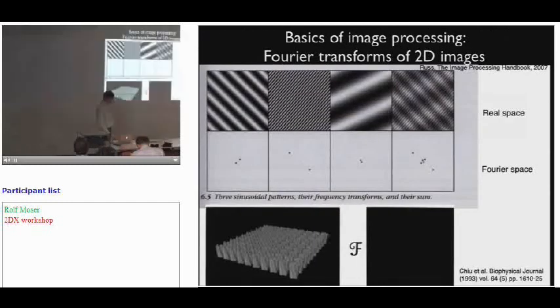Now, if we make this a bit more complex, going to a 2D case, we can construct an image with a two-dimensional sine wave. If you look at the Fourier spectrum, so this is only the amplitudes plotted, you would see a discrete frequency. Now we rotate this pattern and have a much higher frequency, so then the spots move further out because we have a reciprocal relationship.